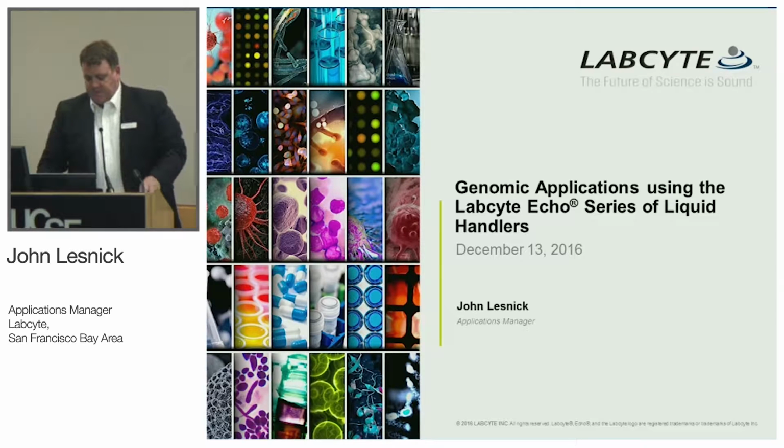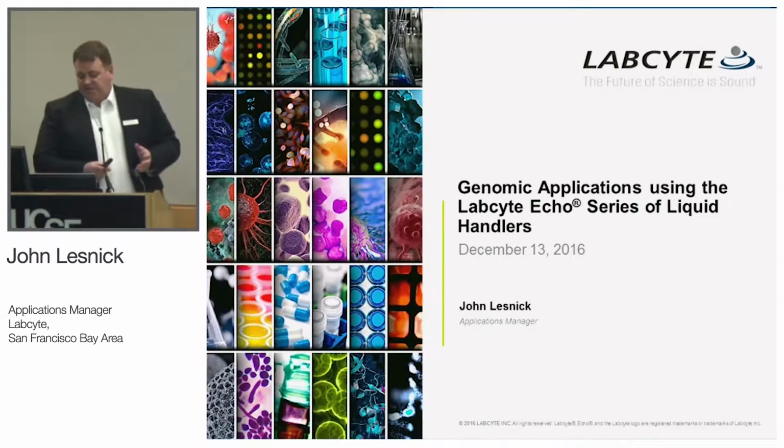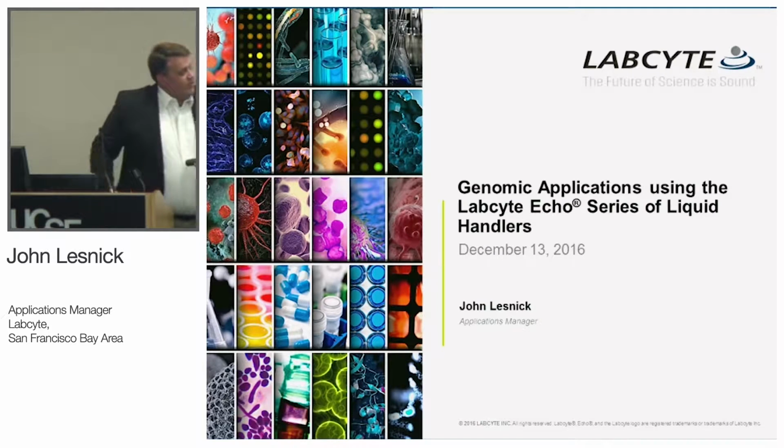So as Chris mentioned, I'm going to give you an introduction and go into a little more detail about some of the genomic applications that we've developed at Labcyte using the Echo Liquid Handler. We're going to be using both the 555 and the 525 for some of these applications. Chris highlighted a few of those and the differences. I'll touch on them as we go through.